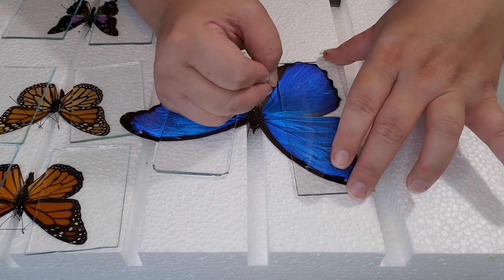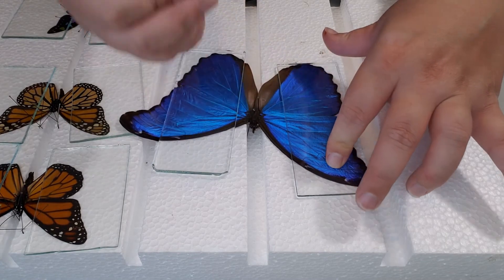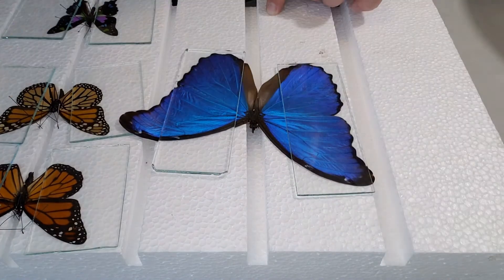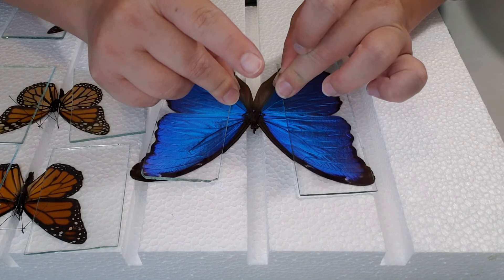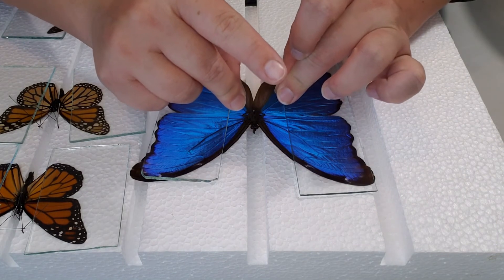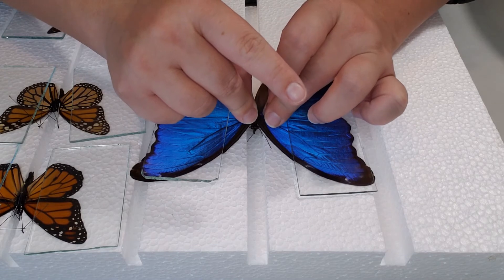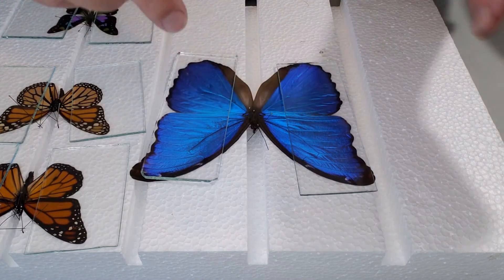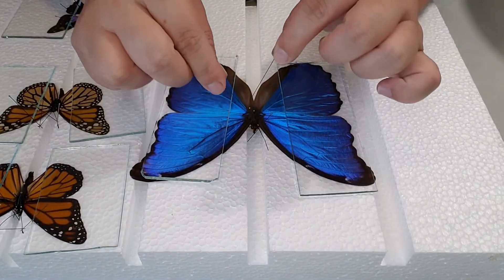Go ahead and take your pin and find the veins on the wings. Try to very carefully move the wing without sticking the pin all the way through — just kind of poke at that vein to get that wing moving. It'll take a little bit of getting used to. You can do that with both the forewing and the hindwing until you get it into the position and angle that you want. Then do the same with the other side.